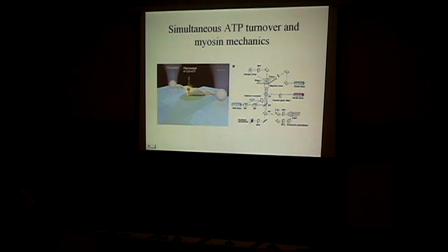You have the myosin molecule, which is found in muscle, that is known to have a power stroke along the ATP cycle. This power stroke can lead to the movement of the actin filament that is suspended over the myosin, using two optical traps holding two ends of the actin filament. So you can use an optical trap to measure the power stroke mechanically.